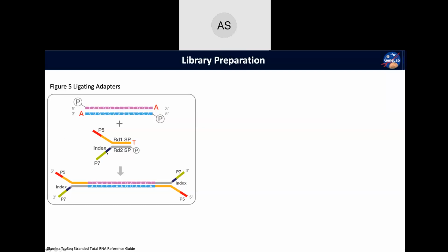Make sense? Yep. And we're going to watch an awesome video that's really going to hopefully bring this all together. So yeah, primer attachment, keep track of orientation of the strand, all great guesses.